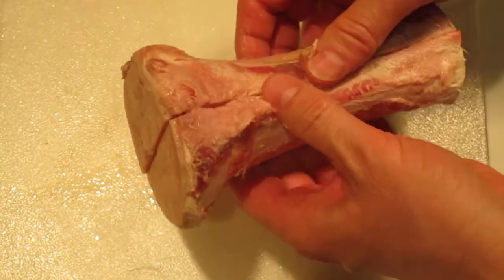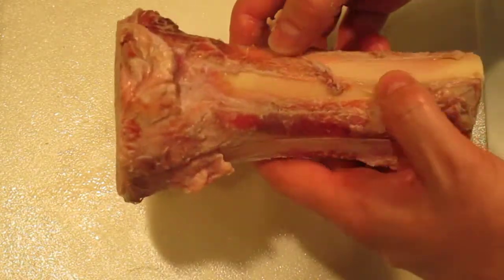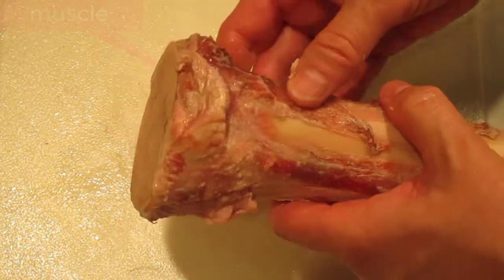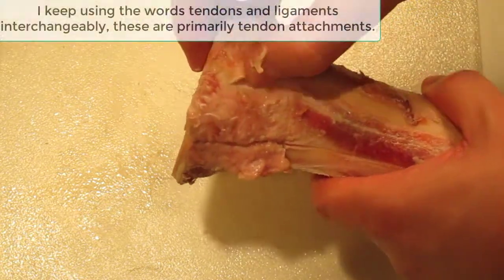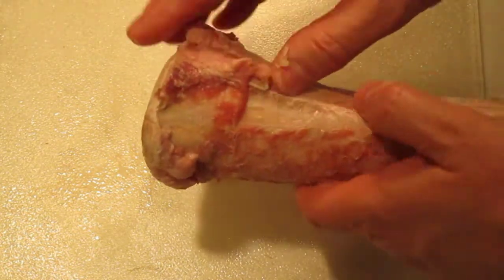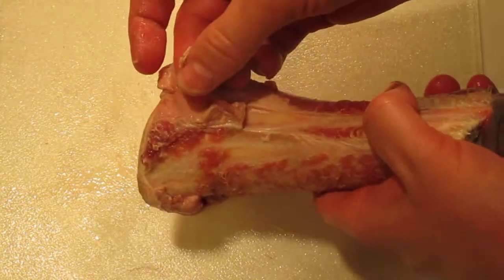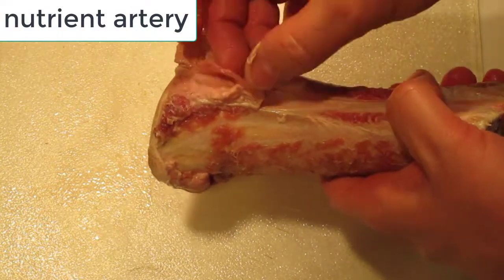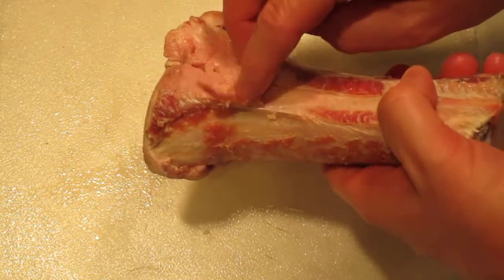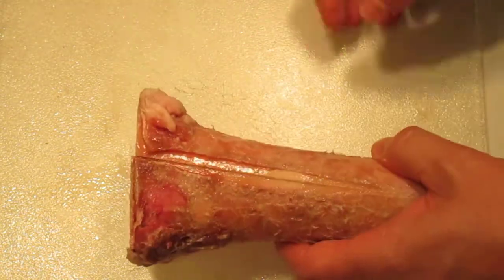This is a typical soup bone you get from the butcher. You can see muscle here along the side, and also some tough attachments of ligaments. There's this red thing sticking off — this is an artery, the nutrient artery, and it's going into the nutrient foramen which is underneath there.